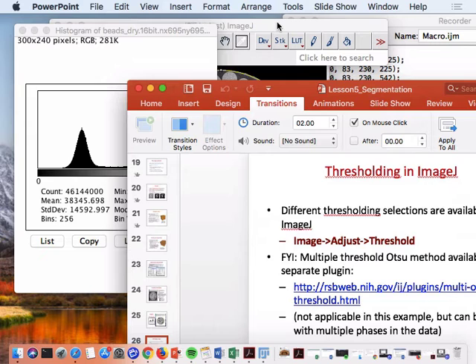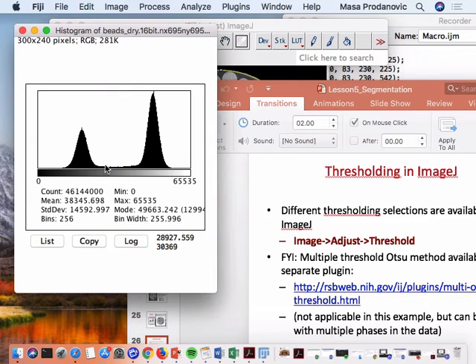And why don't all of you pick slightly different values? So anywhere here, okay, is sort of a fair deal. If you move your threshold ever so slightly from here to here, the difference between those two choices is whatever the volume fraction is of this many images, okay, of this many pixels. So that's not a lot. Let's actually see how many. So this is difference between choosing a threshold at 30975 and 31 and next one up.